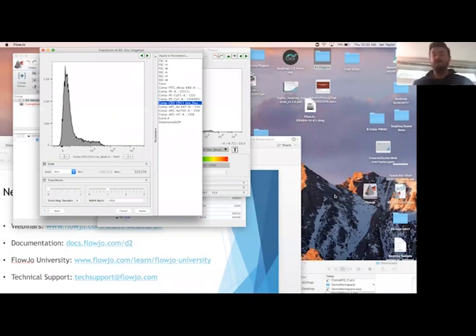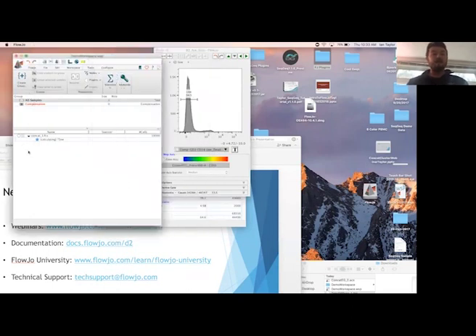And I might note, there might be some confusion here. The bi-exponential transform is only for the flow parameters, the data that you're going to be performing the mapping on, not on the tSNE calculation itself. The tSNE is going to wind up being linear. In the new workspace, yeah, let's check that out. Sorry, the same user is pointing out that I'm not checking that in the new workspace, so let's check that out.